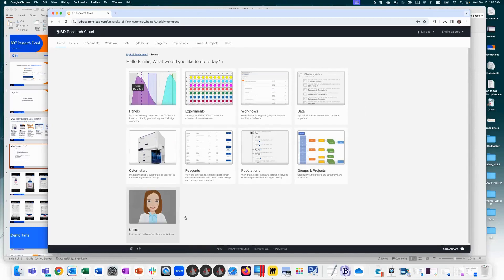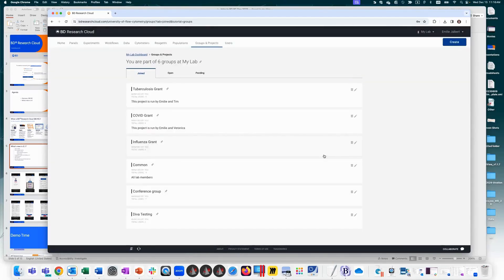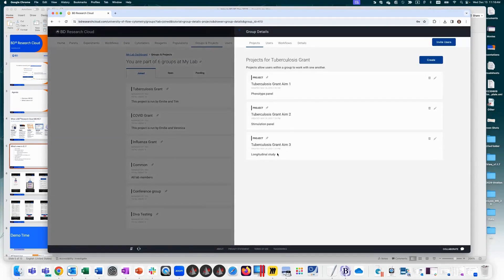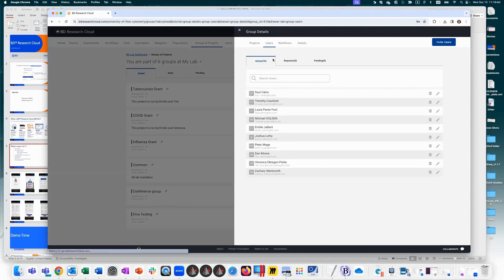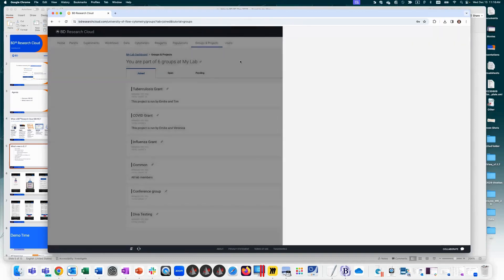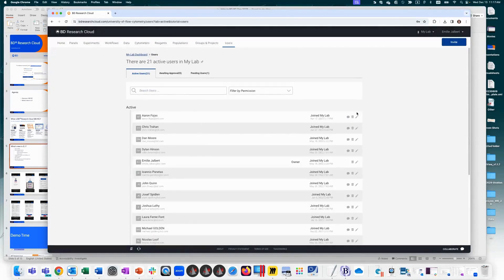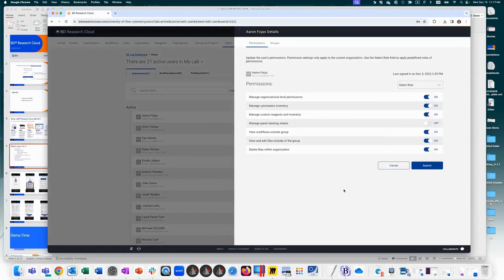The last tabs are groups and projects, and users. Groups and projects organize who has access to what data — you create groups, invite users, and within groups you can have additional subfolders representing projects. You can assign different group-level permissions, and at the users tab you can see organization-level permissions: whether a user can modify cytometers, view data outside their own group, manage staining sheets, and so on.